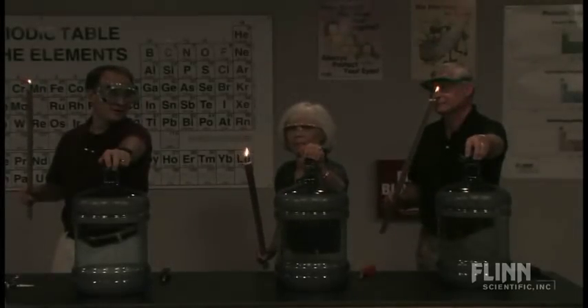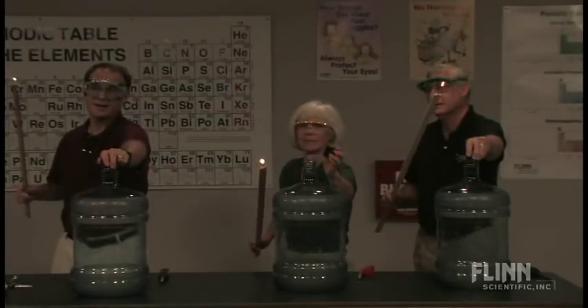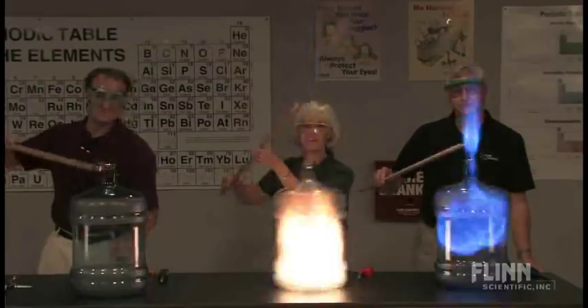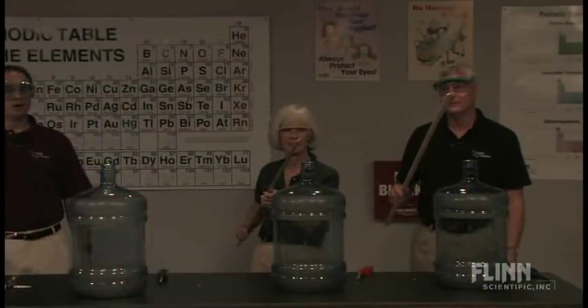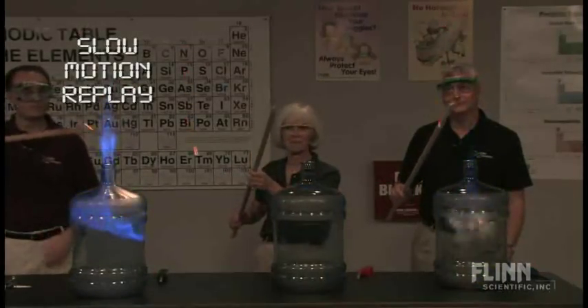Left hand on. Ready, Steve-O? Ready. And let's light them. As you can see, there was a slight difference in the rate of reaction.